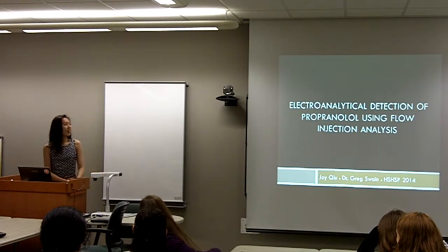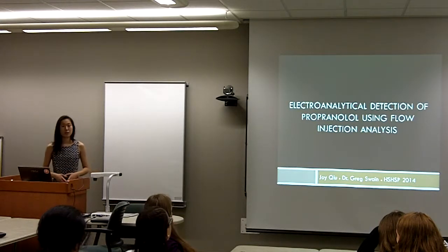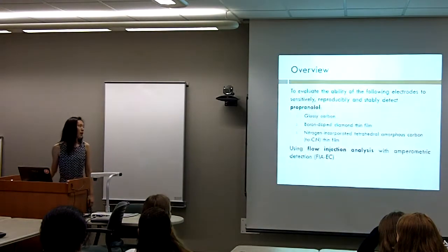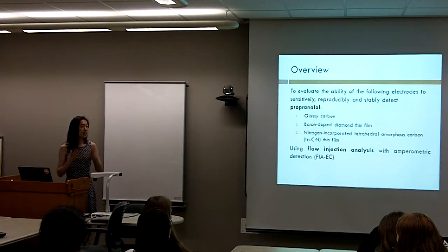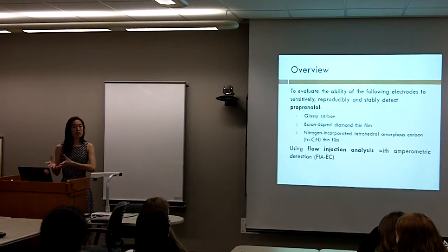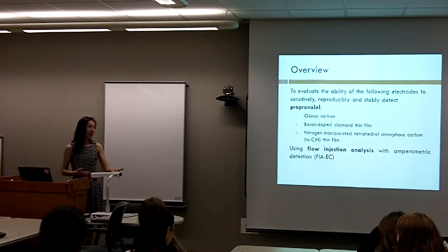Dr. Greg Swain, working on developing a method for the electroanalytical detection of propranolol using flow injection analysis. So in my project, I sought to evaluate the ability of 3 different electrodes to sensitively, reproducibly, and stably detect concentrations of propranolol. These 3 different electrodes were first glassy carbon, second a boron-doped diamond thin film electrode, which I'll just be referring to as diamond, and nitrogen-incorporated tetrahedral amorphous carbon thin film electrodes, or just TAC.